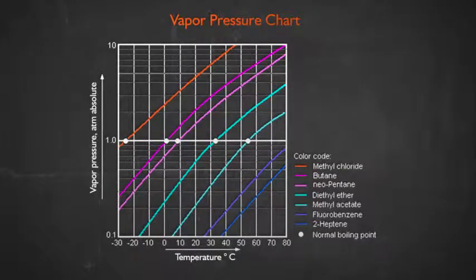So now let's imagine that we could do the following experiment. Instead of increasing the temperature to cause the more volatile compounds to come off, what we're going to do is instead decrease the pressure. So we're going to sit at the same temperature and decrease the pressure. What you see from our curves is there is a critical pressure where the most volatile compounds will start to come off much more than the others. And so the gas that's above our substance will be rich in the more volatile compounds, only by changing the pressure, not by changing the temperature at all.